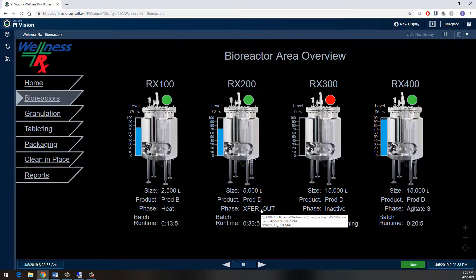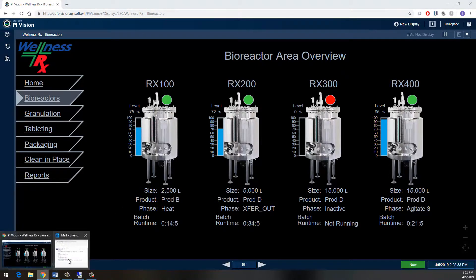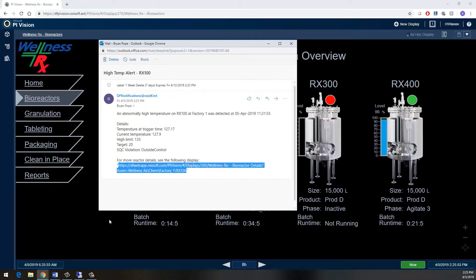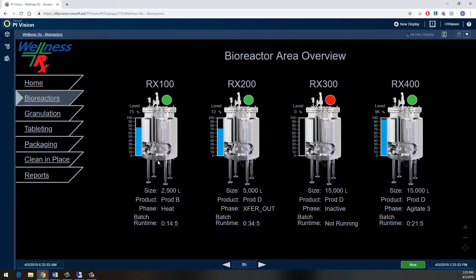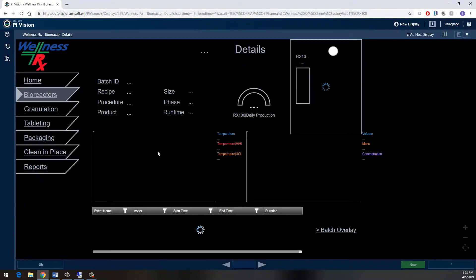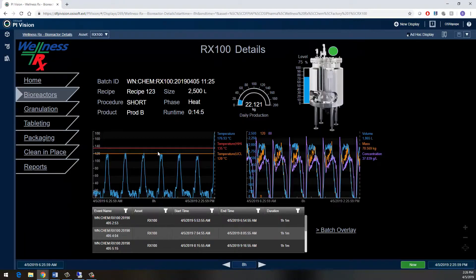If I want further details on any one of my reactors, I can simply click on it. I actually just received a notification telling me that I have an abnormally high temperature on my Reactor 100. I already have PI Vision open, so I'll just come in here and click on Reactor 100 and drill down to get more details.